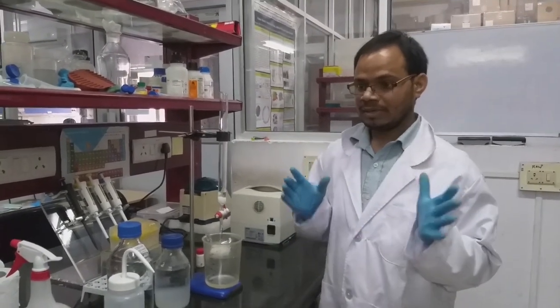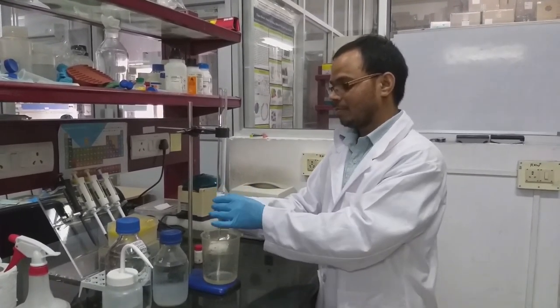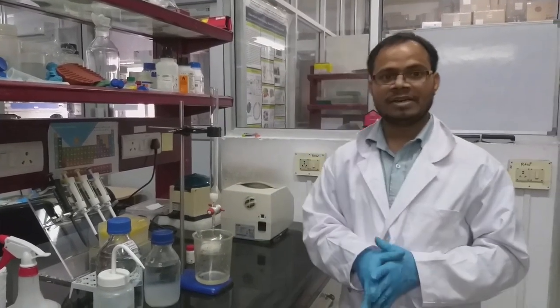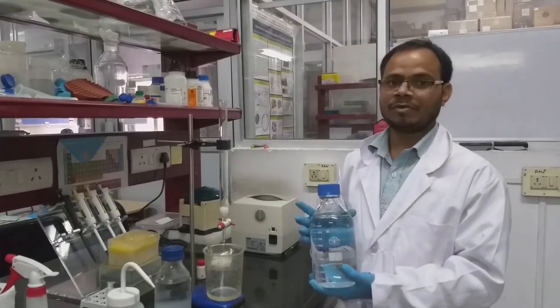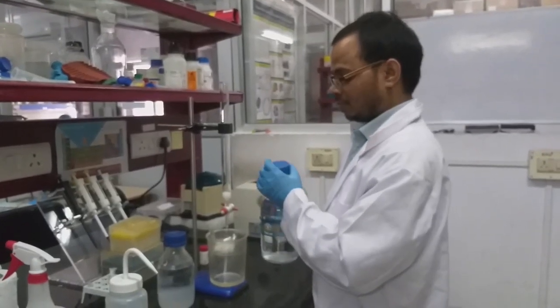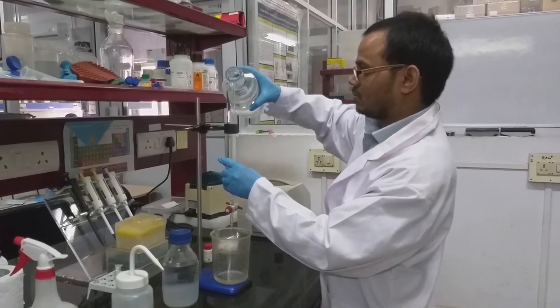So the next thing is we have to add buffer and equilibrate the column. Generally in all gel filtration experiments, we will use 0.05 molar sodium phosphate buffer. So this is already prepared sodium phosphate buffer, pH 7.4. So I will add it like this.